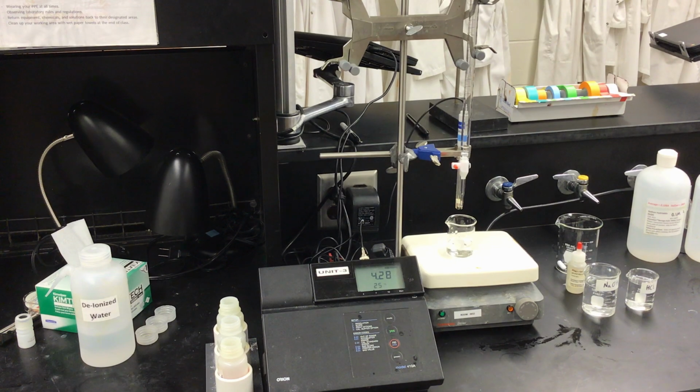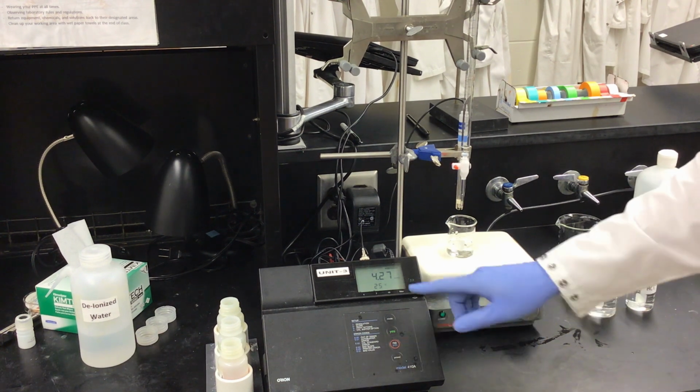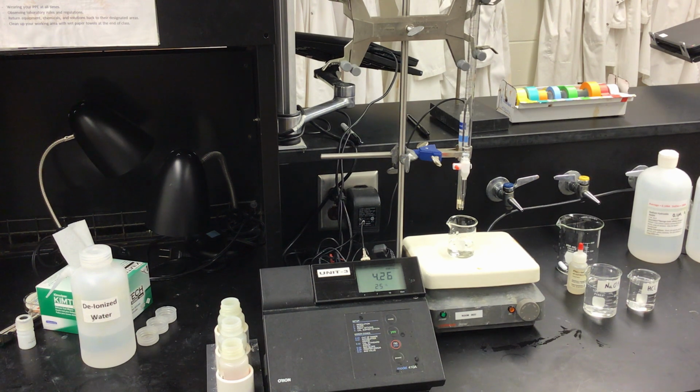So here we are for our acid-base titration for 163L. Here is my setup that I will be needing to do my titration in. I have my pH meter, which I have already gone ahead and calibrated. You can watch the video provided in order to learn how to calibrate the instrument yourself.